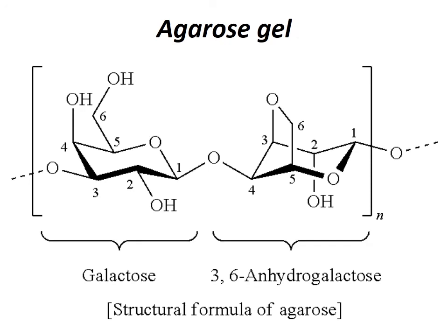So now we are going to talk about agarose gel electrophoresis. Agarose gels are made up of agarose. Agarose is a heteropolysaccharide. It contains a repeating disaccharide unit, which is made up of galactose and anhydrogalactose. So this repeating disaccharide unit makes the agarose molecule. Agarose is soluble in aqueous systems. Its solubility in cold aqueous systems is low, so therefore agarose gel can be dissolved in hot buffers.